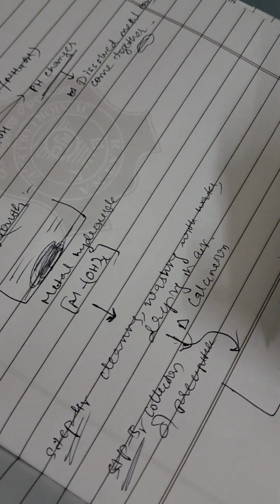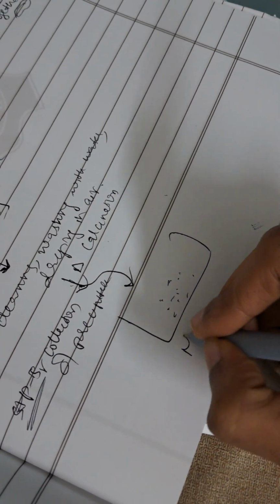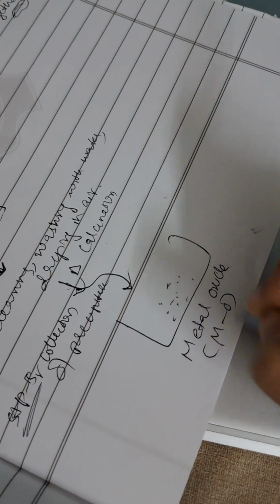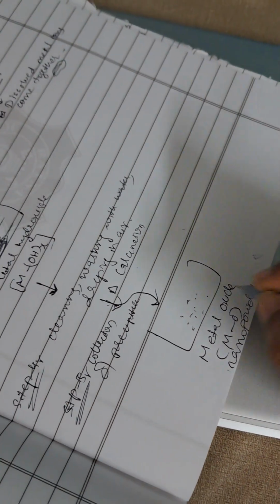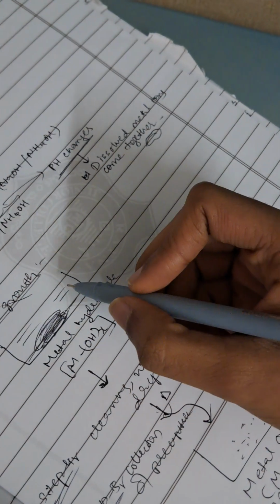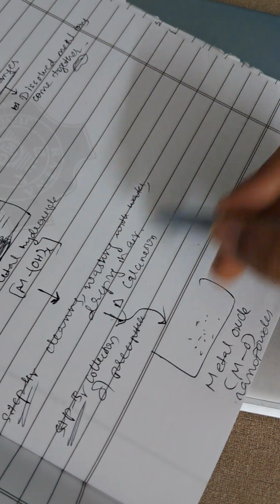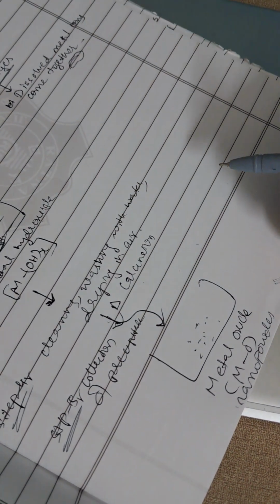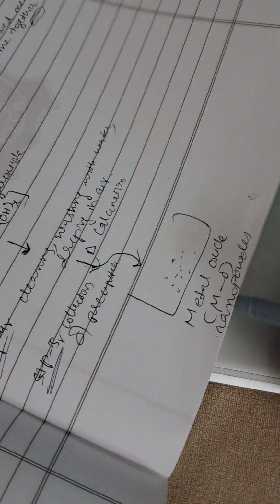When you heat it, you will get metal oxide, MO, which is nano powder. Because that precipitate, that particle has already grown to nano size, but it is a precipitate. We need to collect that. So we need to wash, clean and dry it. After that we do calcination, means heating at high temperature in the absence of air. Then we will get metal oxide, that nano powder.